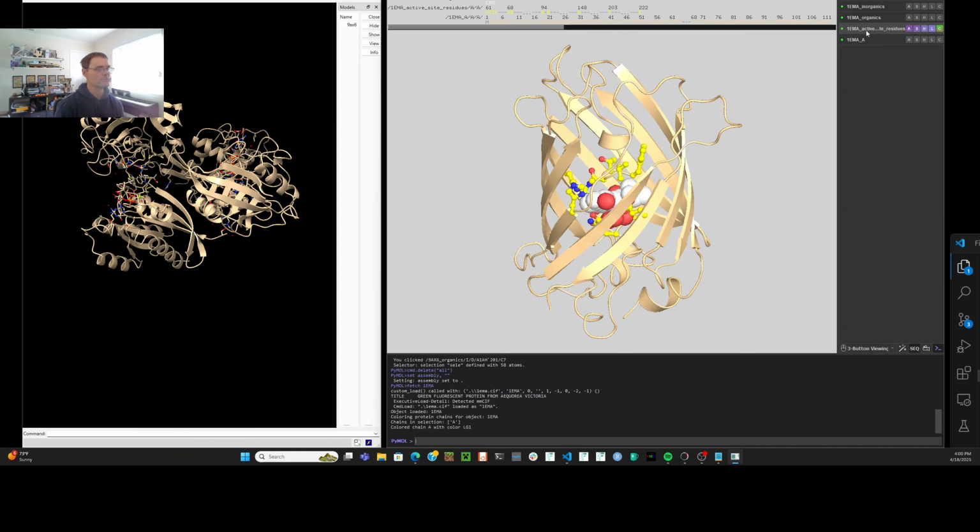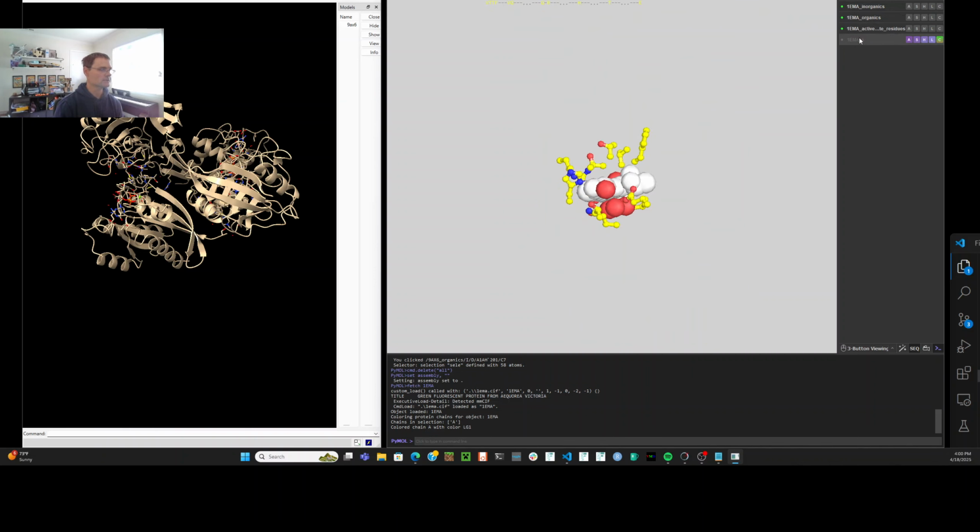So I can disappear, reappear. I can take away the chain and just show you the ligand. So we'll do this one more time.